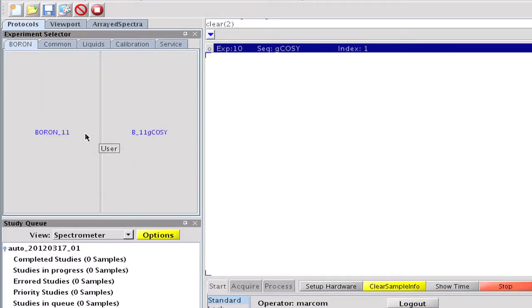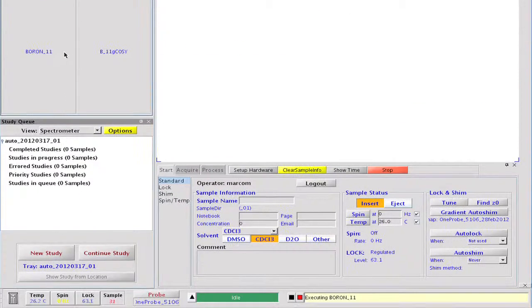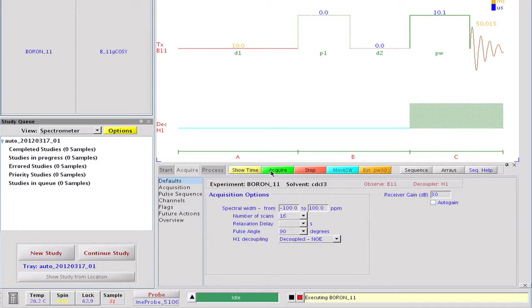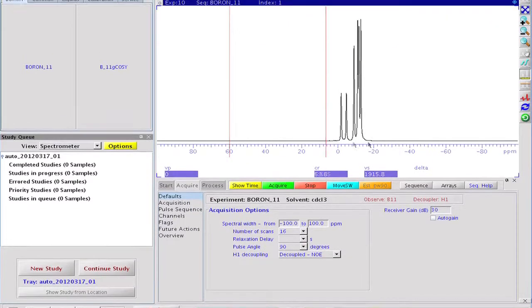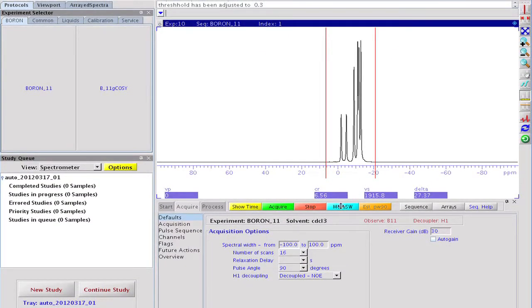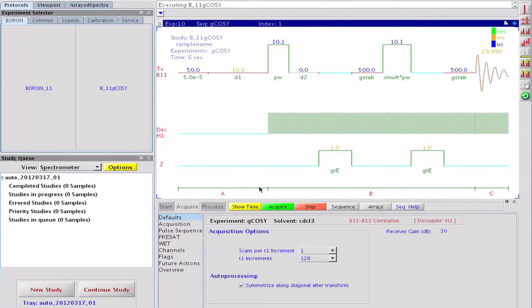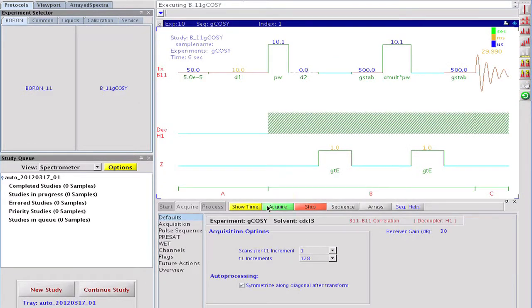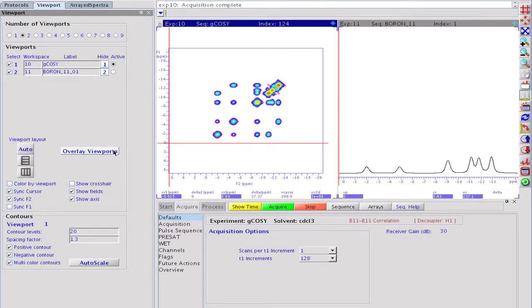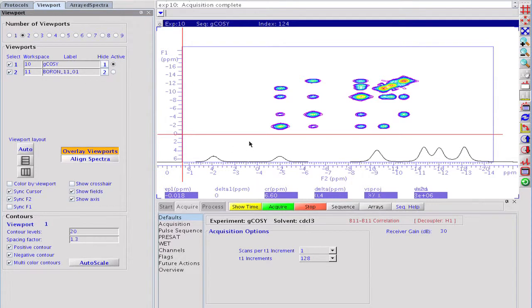Our new boron and boron COSY protocols are ready to be tested. Clicking on boron 11 and the acquire button, we have the boron survey spectrum. We may zoom into the signal region, narrow the spectral window, and click on B11G-COSY to set up the 2D experiment. After a few seconds of acquisition, the COSY map reveals an extensive coupling network among the boron atoms.